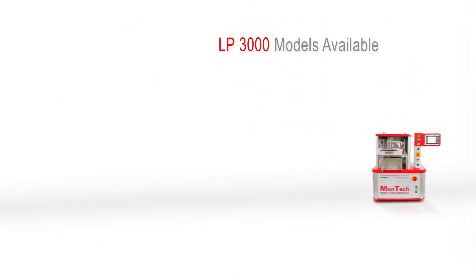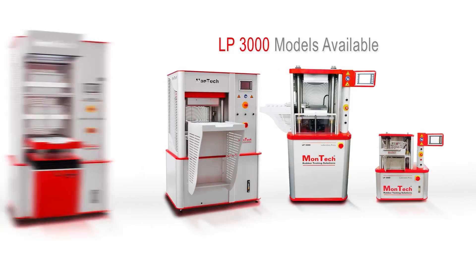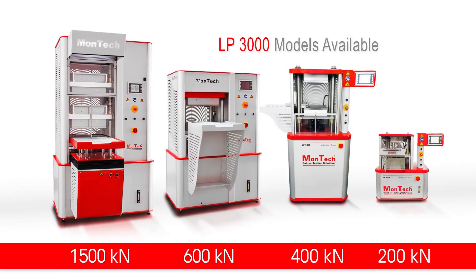With models ranging from 200 to 1500 kilonewtons, the Montec LP3000 is a perfect fit for any lab. Many optional features are also available, allowing you to customize the LP3000 to suit your specific testing needs.